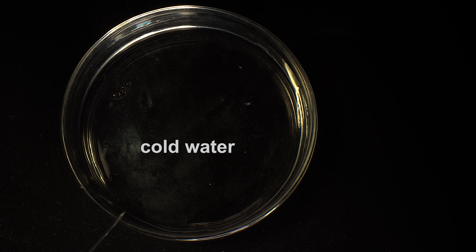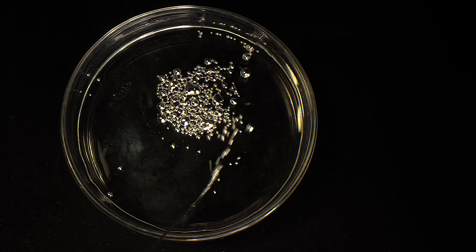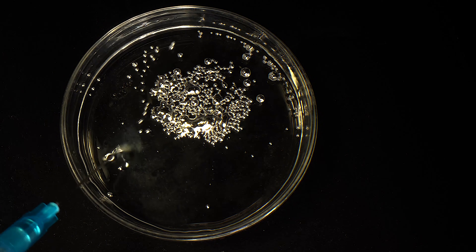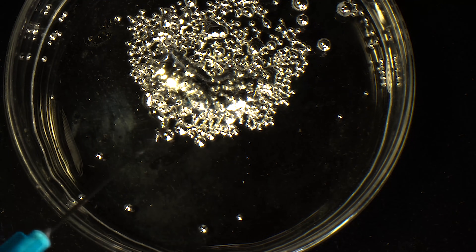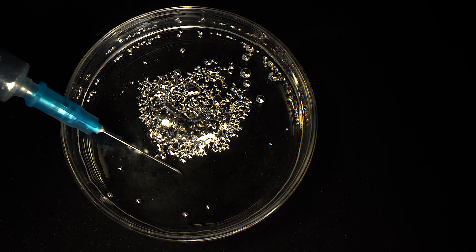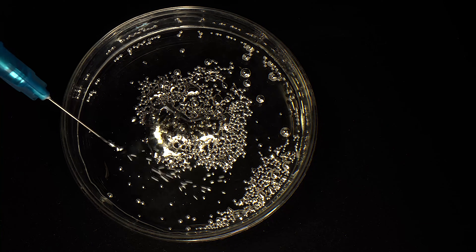And now I will retry the experiment with gallium, pushing it out of a syringe into cold water. When the jet gets into the water, lots of small gallium balls start forming. They are able to merge into one big drop. Let's see this process occur both at a very close range and in slow motion.